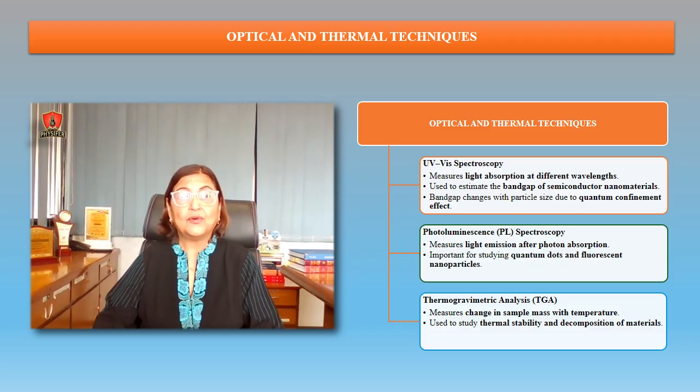Then we have photoluminescence, PL. This spectroscopy measures the emission of light from a material after it absorbs photons. It is essential for characterizing quantum dots and fluorescent nanoparticles.